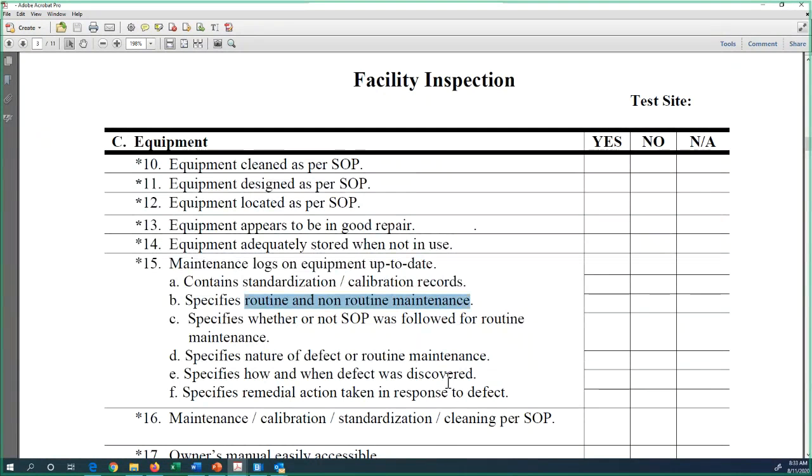Typically, for example, when you do routine cleanup or routine maintenance, preventive maintenance, your LCMS response will be double the peak. That's normal because you cleaned up the system. The ion source is much better. Everything's better. And a lot of times you change some parts. That's routine, because about every year the service engineer comes to do the work, which is fine.